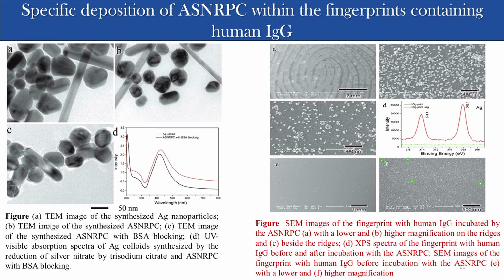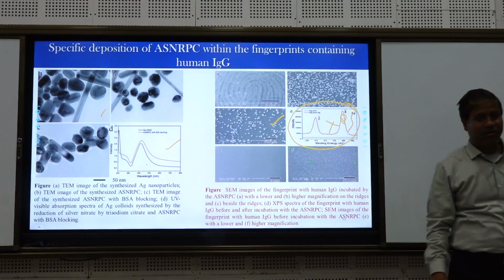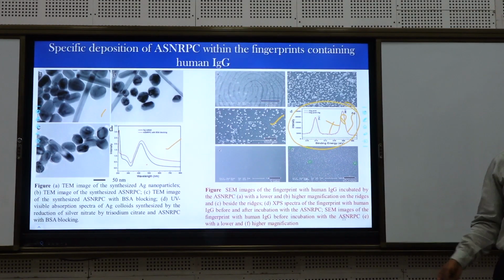Now how is it possible? If it is done by biologists, because you have this protein and all these things, we cannot handle protein and all this antibody. So if it is done by biologists, how come they do this? This is in the domain of a physicist or chemist, physical chemist. And this is purely spectroscopy, XPS, photoelectron spectroscopy.